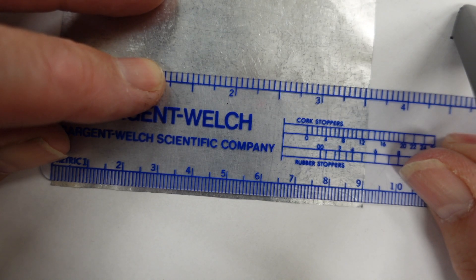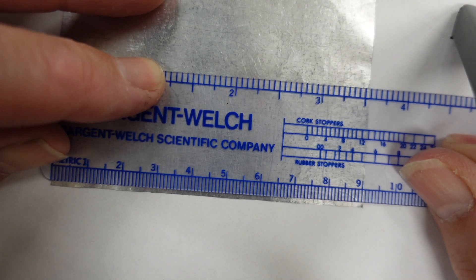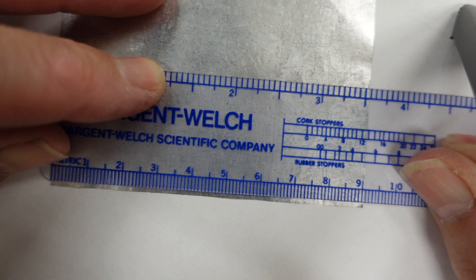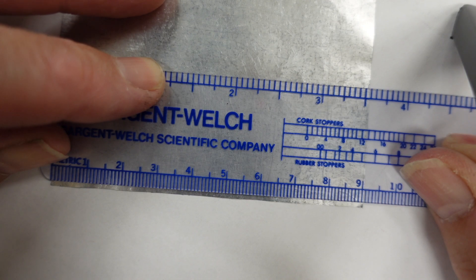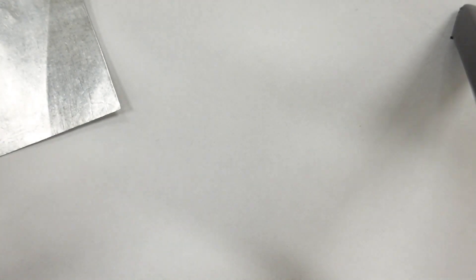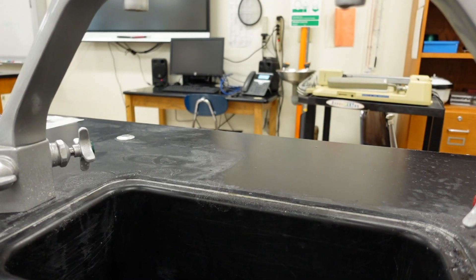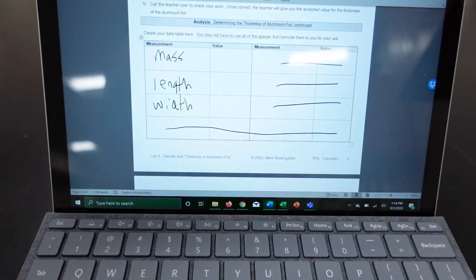There we go. And there you have it. So now you have the mass and the length and the width.